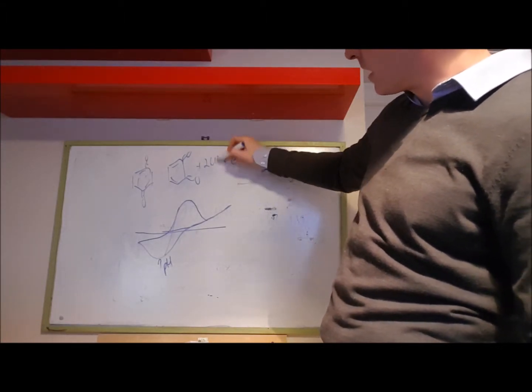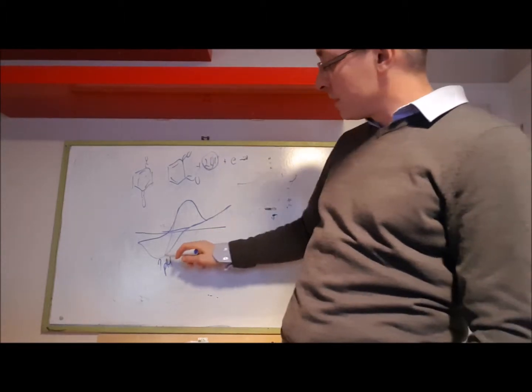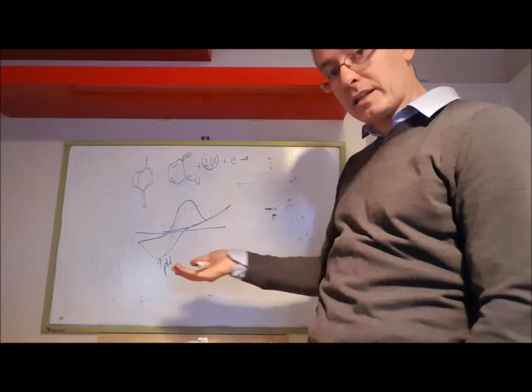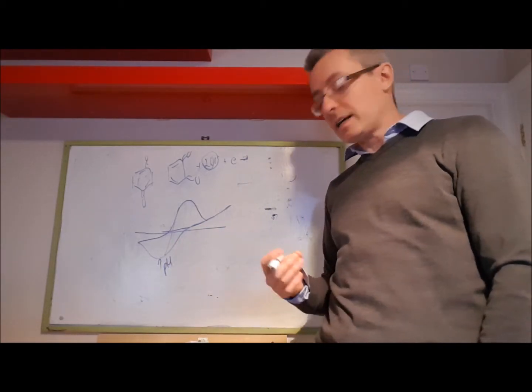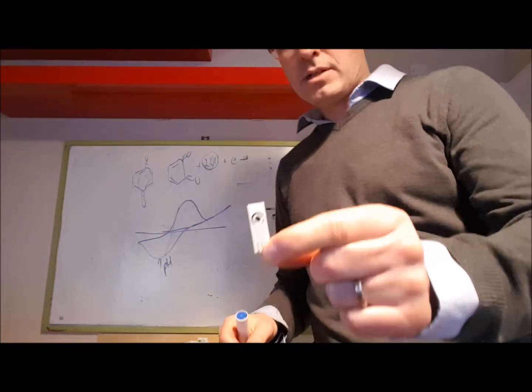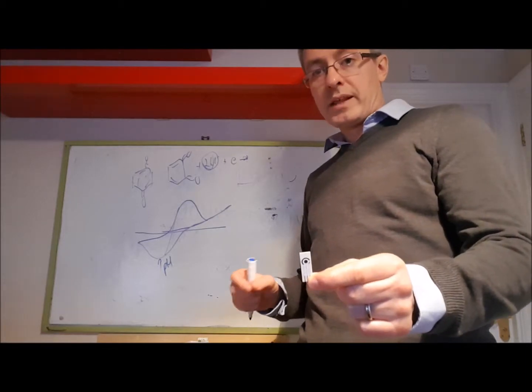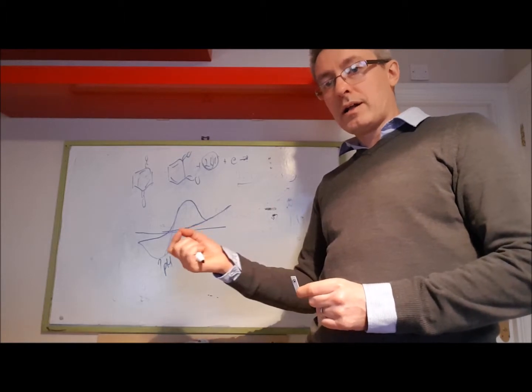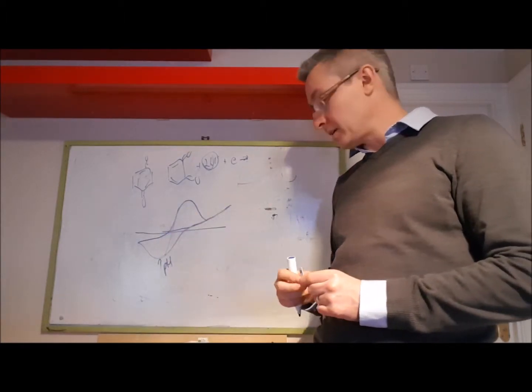So in its peak position, you need these protons, and therefore the more protons are in there, or the less protons are in there, i.e. the pH, then these peaks will shift. So that is the idea of using the intrinsic electrochemical activity of the carbon electrode, and you're looking at the peaks associated with the electrode, and you're saying to yourself, all right, pH in my sample, which is oil, is shifting the peaks.